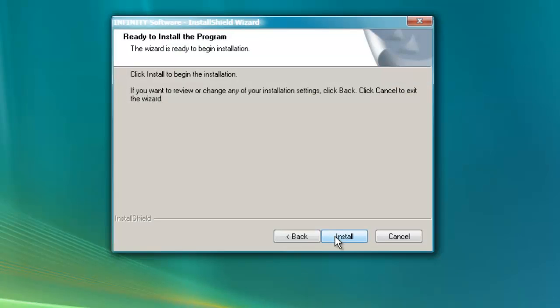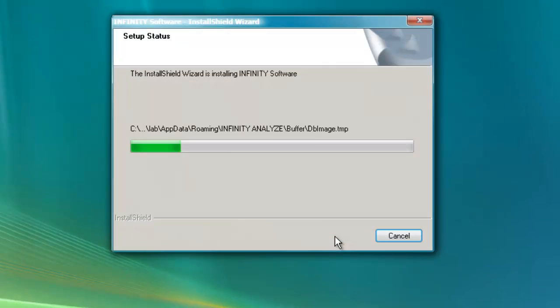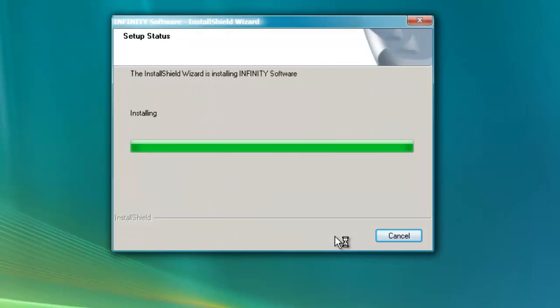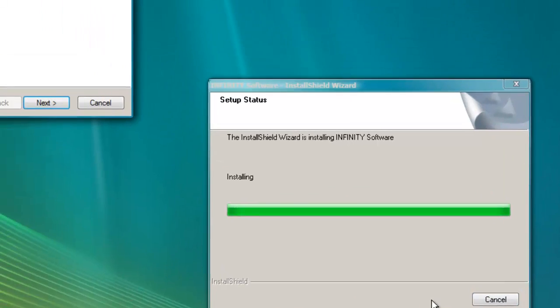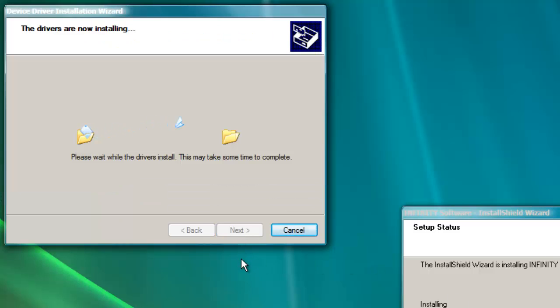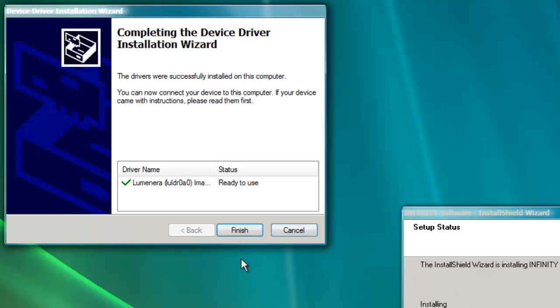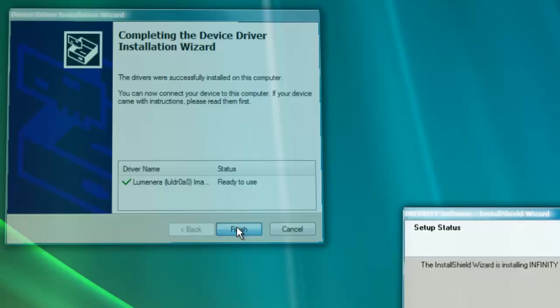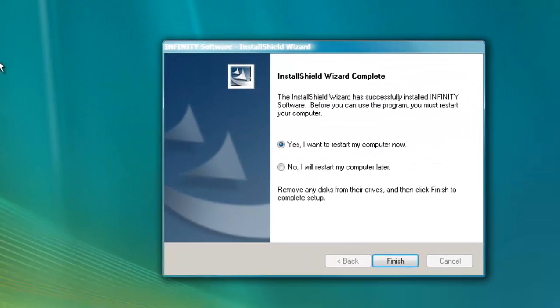This screen asks you to confirm the installation. A dialog pops up to install the software drivers. Finish the driver installation.